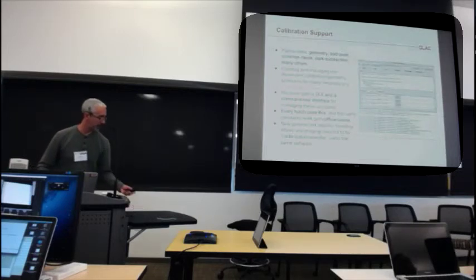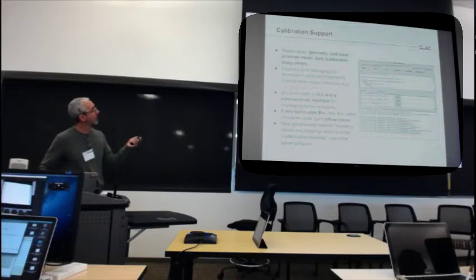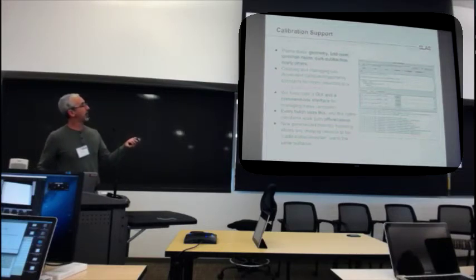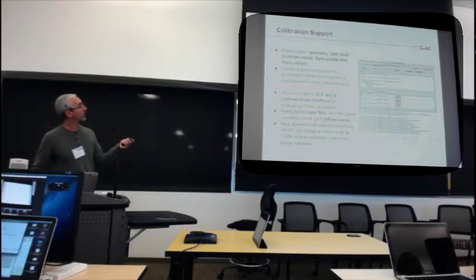Okay, so I'm going to finish up here. I'm going to relatively quickly go through some of the remaining features, and all of these are relatively new in Psana, I would say within the last 10 months or something like that. So we have better calibration support, just like the rest of you guys are doing: geometry, bad pixels, common modes, dark subtractions for CSPad and for other detectors as well. You guys focus mostly on CSPads.